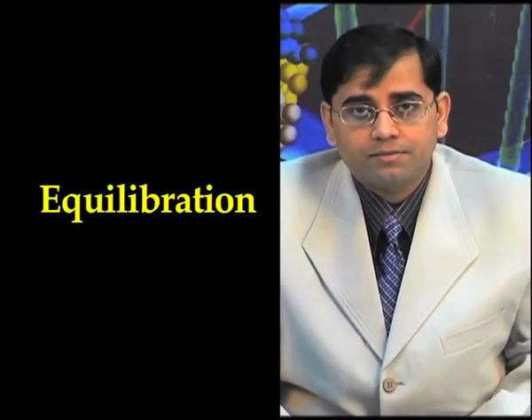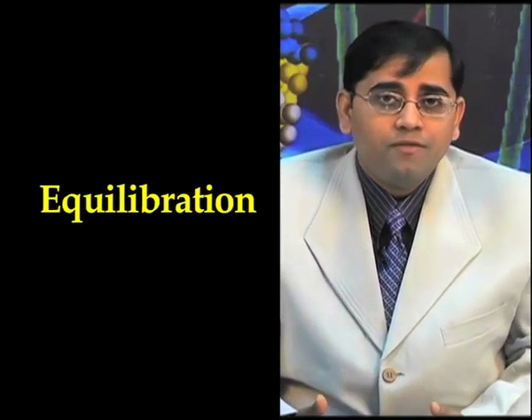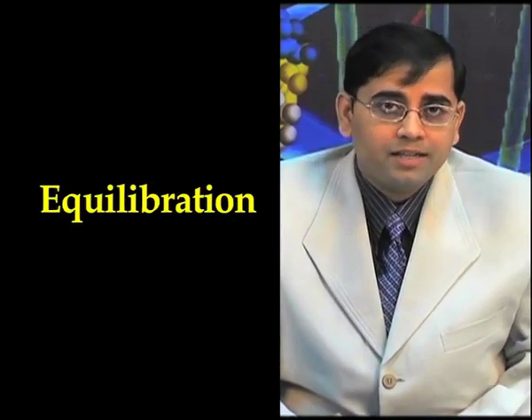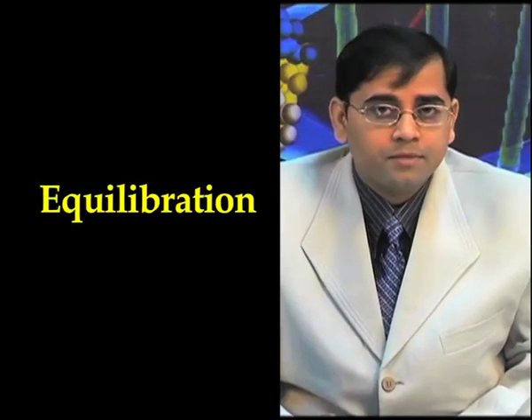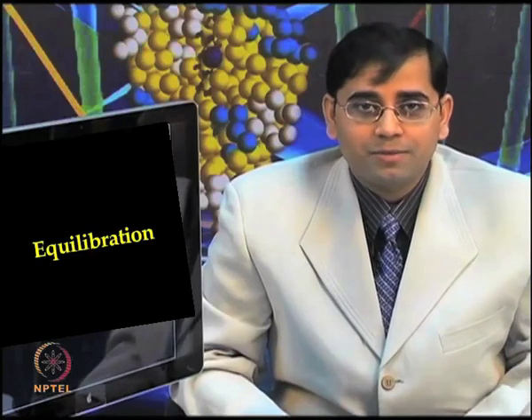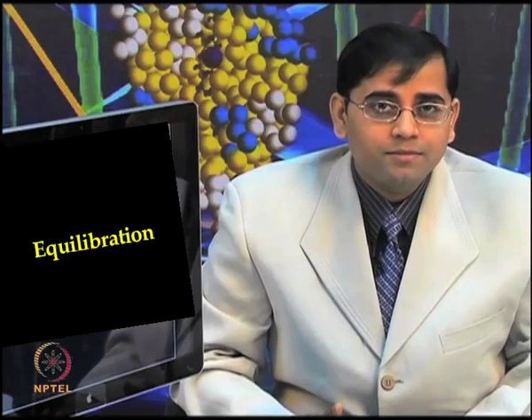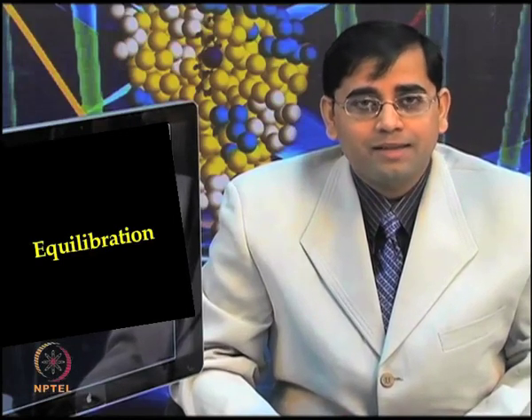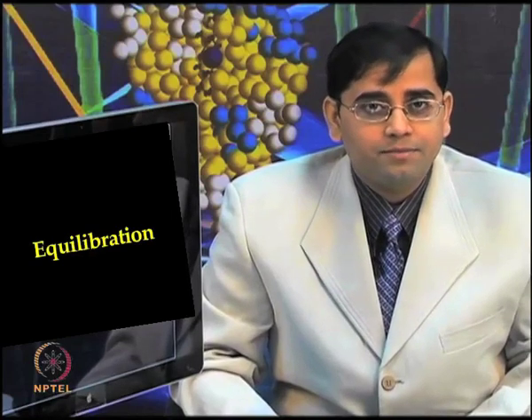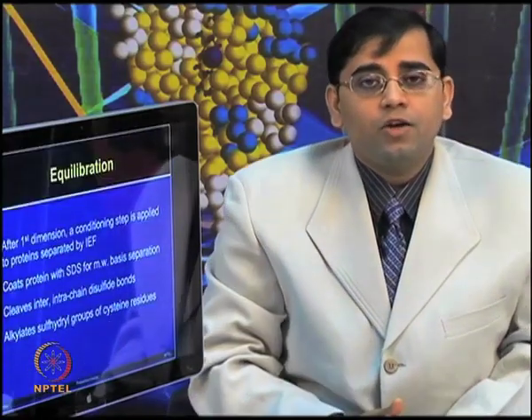and alkylation. When you are taking the protein sample alone, you have the flexibility of boiling the protein sample in tubes and doing all those treatments to denature the protein separately. But now, your protein is already focused inside the IPG strip. So, you do not have that flexibility here. All you need is to prepare your IPG strip in such a way that you can apply it on top of an SDS-PAGE gel. So, I will show you what steps are required in the equilibration step.